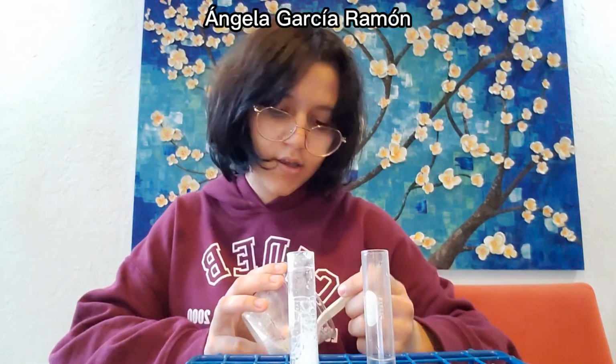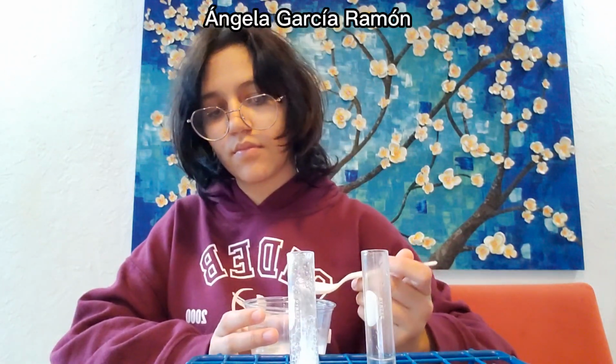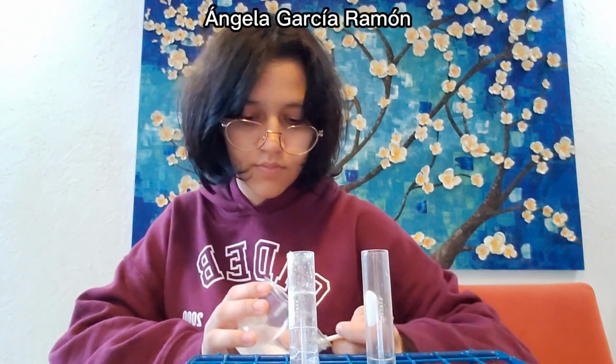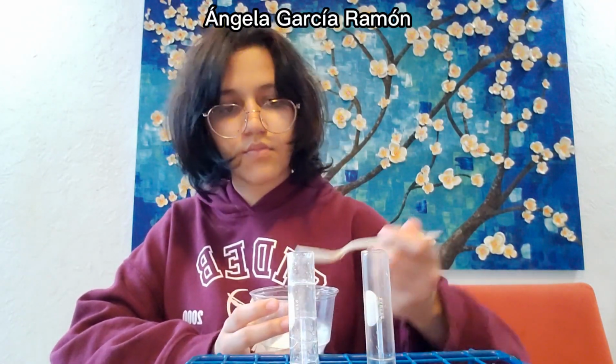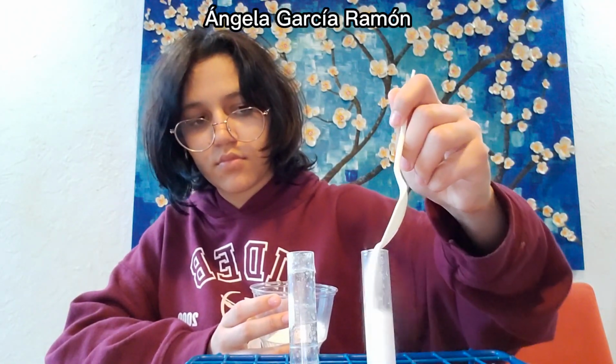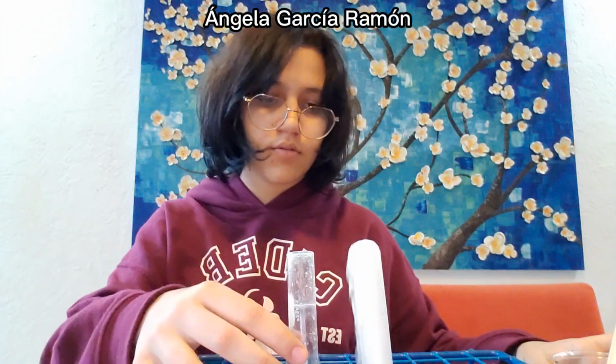We have to do the same for vinegar. And see the reaction. This reaction was faster, and it's also spilling down.